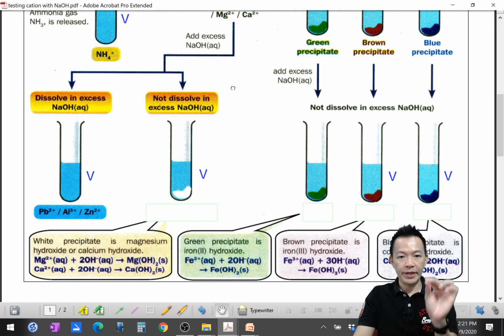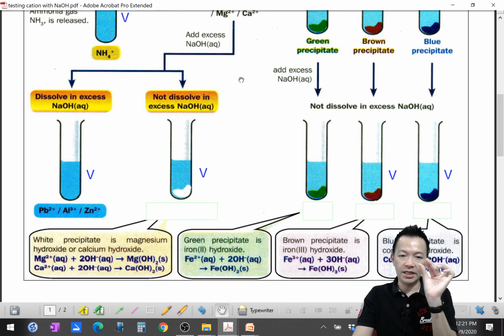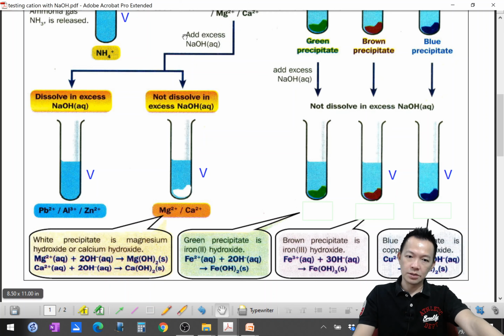So, it will be 剩下的 calcium magnesium. So, calcium salt solution, magnesium salt solution. 你加一点点的 sodium hydroxide, 你又看到白色. 你加多多过后, 白色还有在了. So, calcium magnesium, insoluble in excess of sodium hydroxide. 它不能溶解在多多的 sodium hydroxide. So, 什么意思呢?